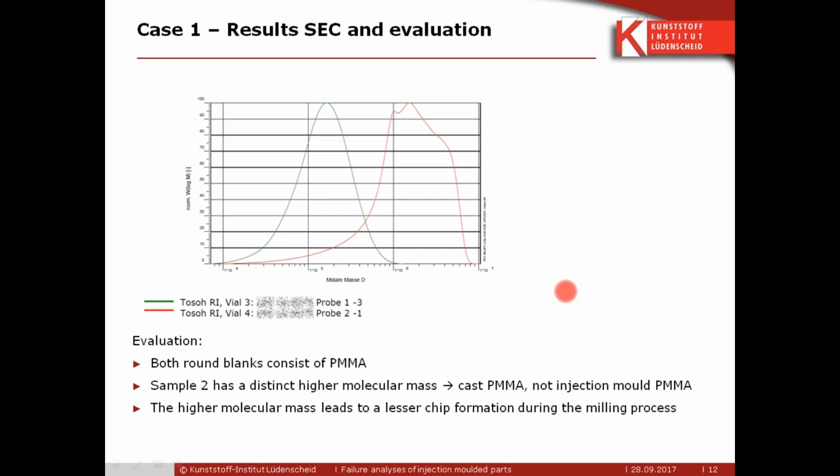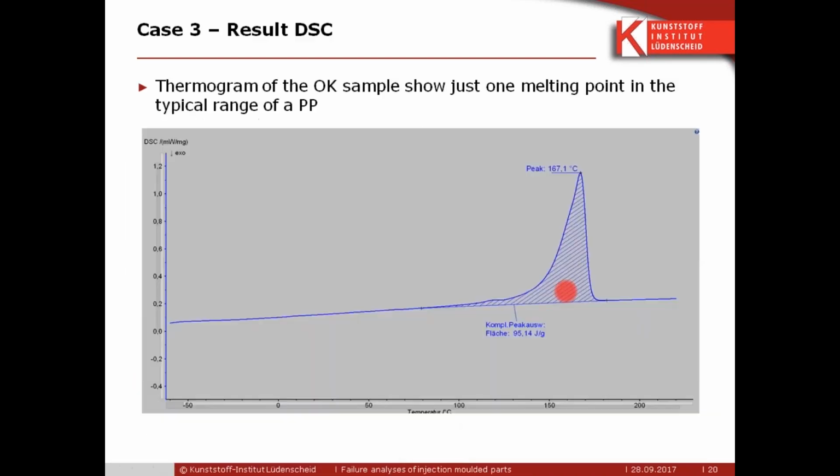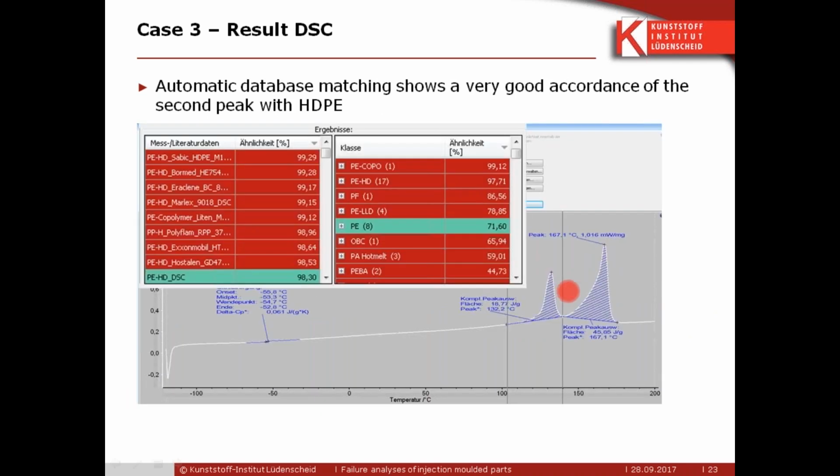So, of course, if you would do mechanical tests on this, which is destructive testing, the milling, if you do mechanical testing on this, this would also clearly show differences in the mechanical performance, would it? Yeah, definitely. If you do tensile tests and so on, this would clearly show a different performance. Would you agree, Martin, on that? Yeah, I agree.